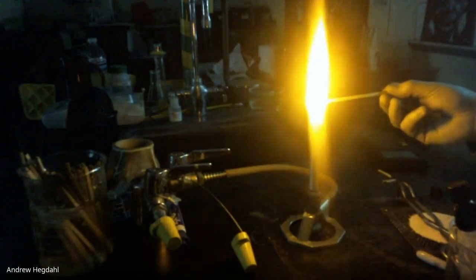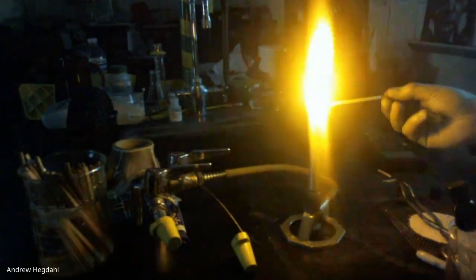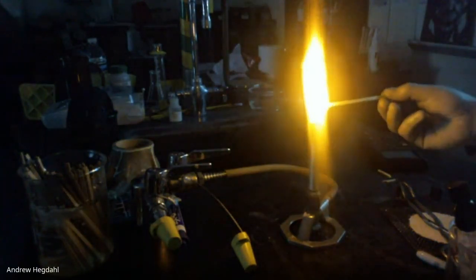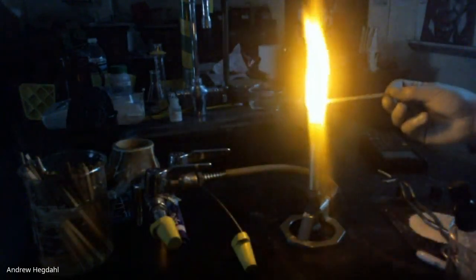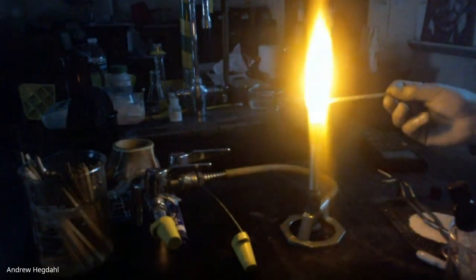Okay, this is I. This is like a yellow orange. So we had two oranges that look pretty similar. I described one as lighter and one as darker. This is distinctly yellow, much more yellow than it is an orange flame. This is letter I.